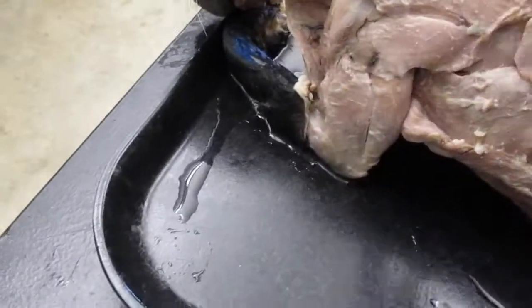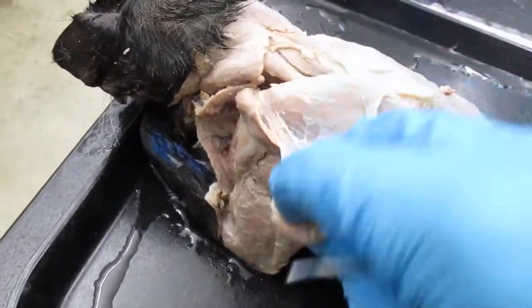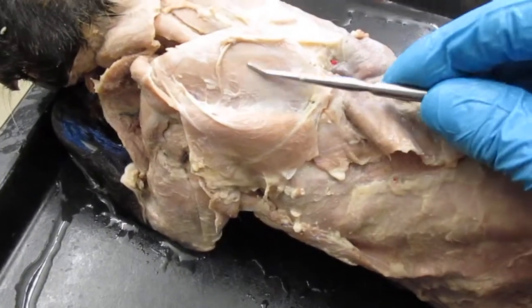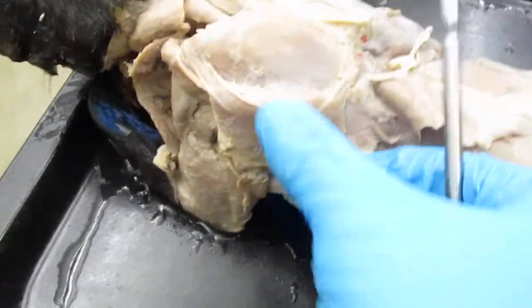Okay, so you can pretty much see the same thing here. You can see the acromial trapezius is being cut, and you can see the supraspinatus right here. Move some fascia.